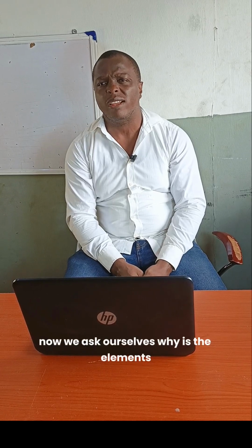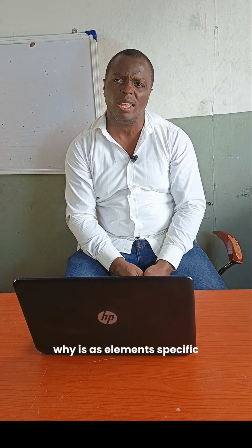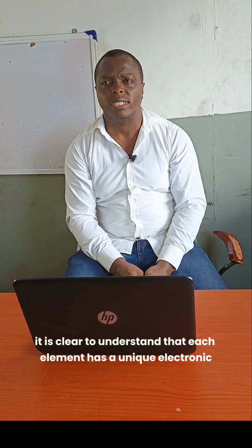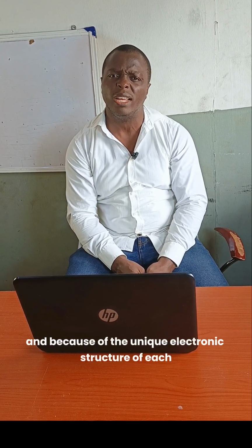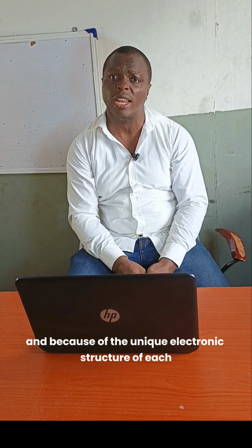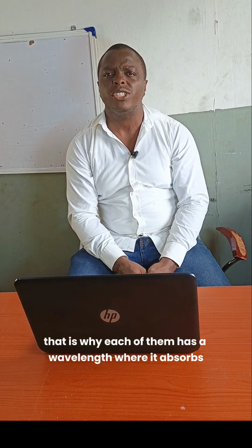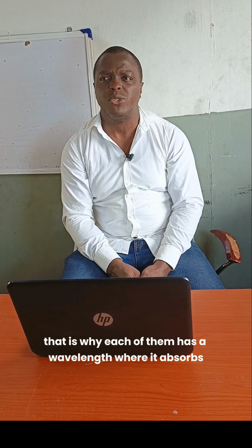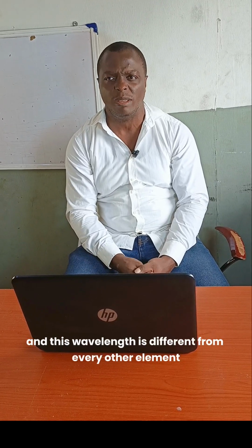Now, we ask ourselves, why is AAS element specific? It is clear to understand that each element has a unique electronic structure. And because of the unique electronic structure of each individual element, each of them has a wavelength where it absorbs, and this wavelength is different from every other element.